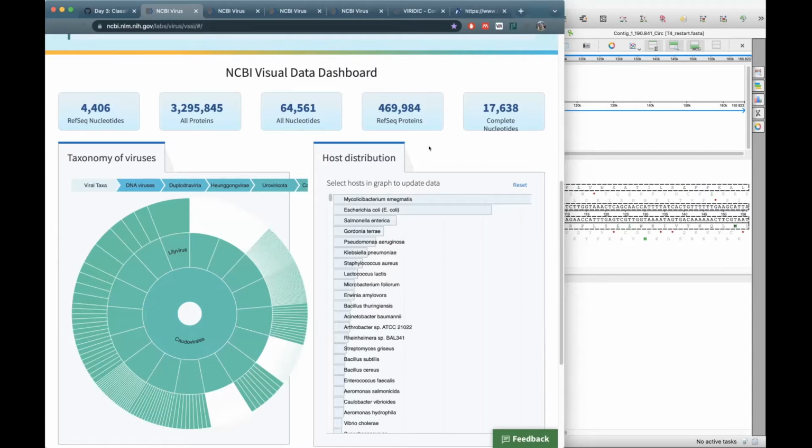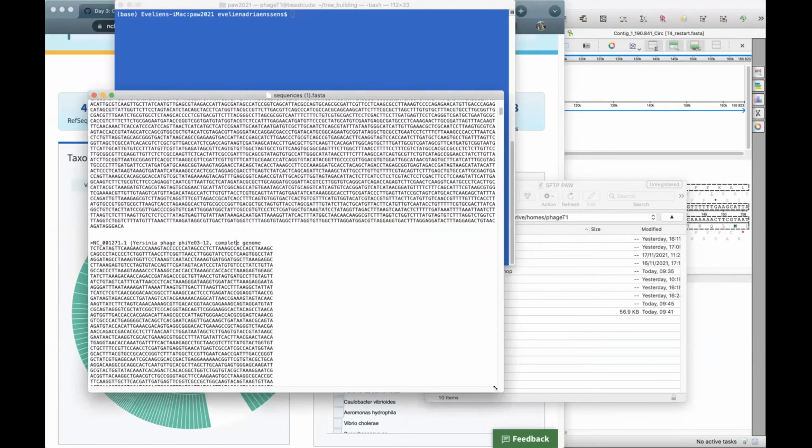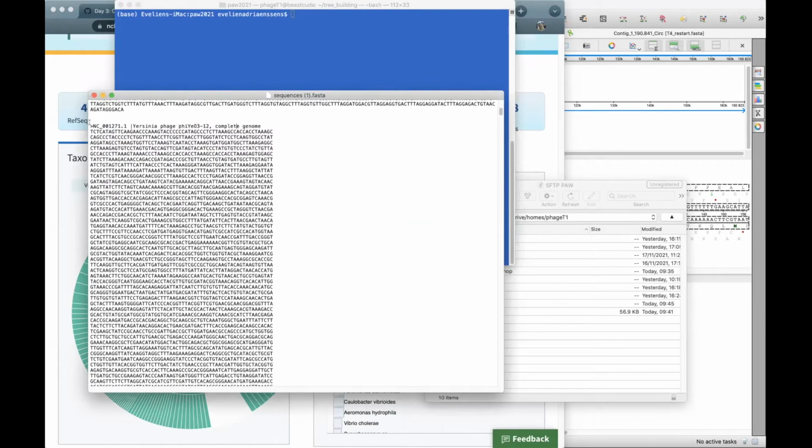Anna, do you have a question? Yes. So I want to ask if you could show how the file containing all the sequences looks like, because you did it in the hidden mode. Yes. Let me see if I can share, new share. Okay, this one. So this is what I downloaded. Can you see this text file? Yeah, I can. Thank you. So, yeah, that's what I wanted to know, if they were all together in the same file, having the very simplified FASTA.